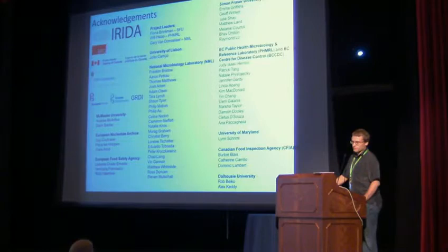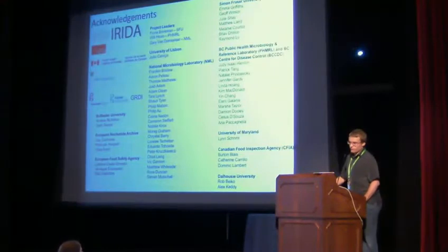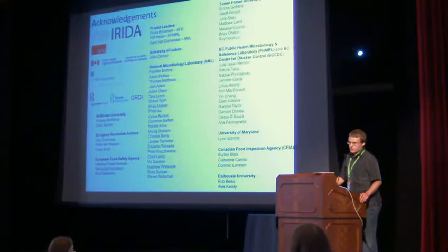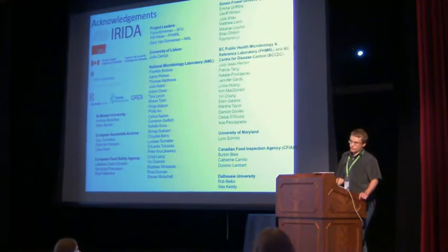So I was also wondering, you mentioned the fingerprints for the various bacteria. Where did those sequences come from? Where did the sequences come from for, sorry, could you repeat that? Yeah, like what are you looking for when you're making fingerprints? Is it 16S or? Oh no, it's whole genome. We're looking at SNPs or SNVs, variants across the entire genome. Okay. Yeah, so that's one method. Another method is looking at genes, variants in genes across the entire genome.